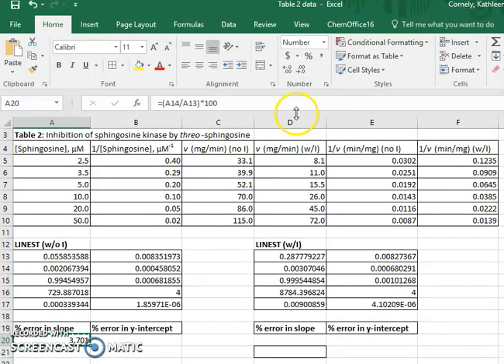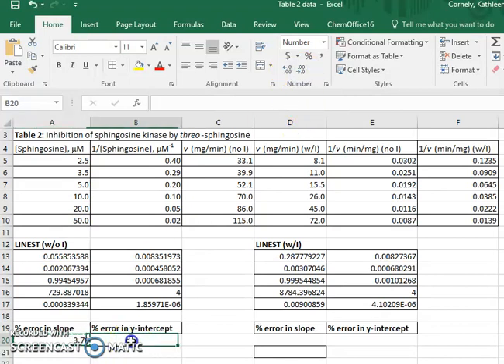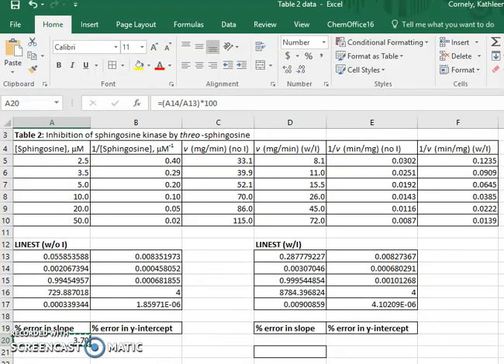I will decrease the value of the significant figures to 3. I can do the same thing for the y-intercept, although here it's easier if I just copy and then paste.